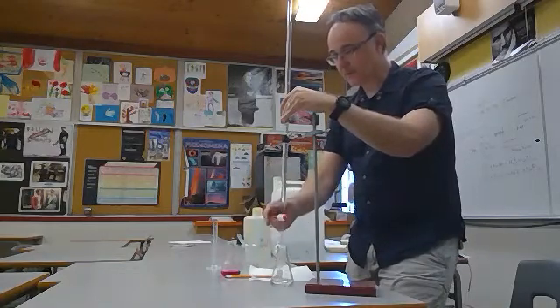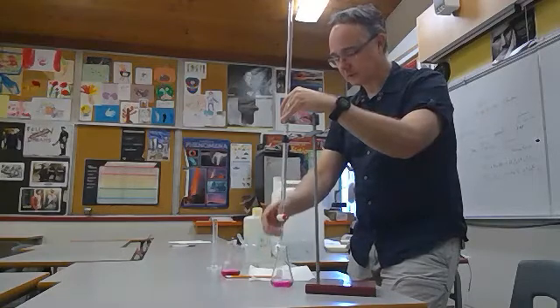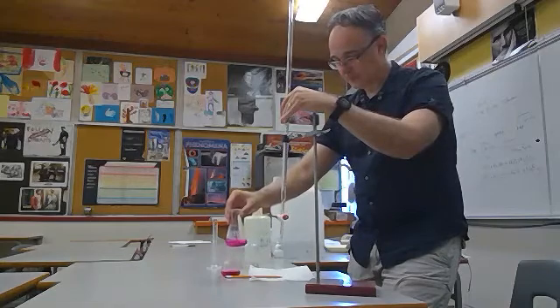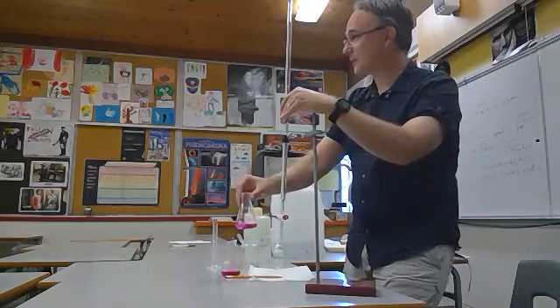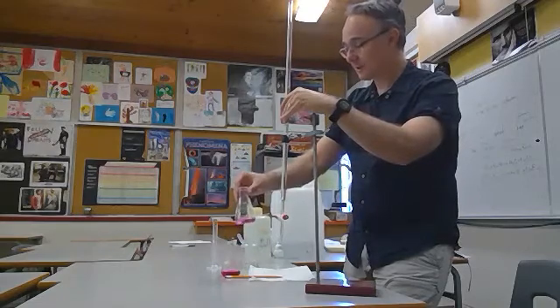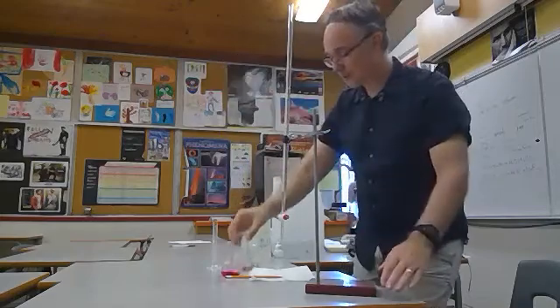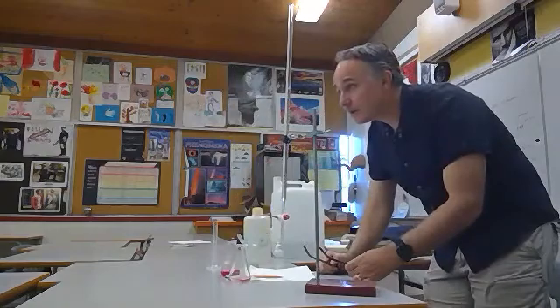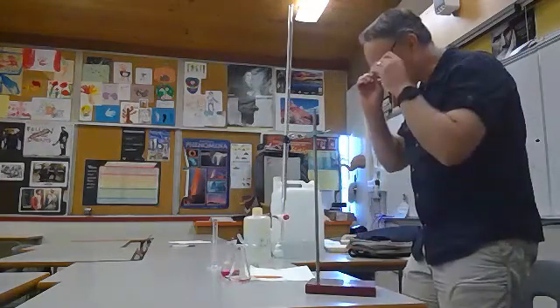A bit longer to get rid of the color change. So even that's almost too dark. I was basically a bit generous there. But you can see it's pretty light, quite a light pink. And so this final measurement here is 19.1 milliliters. So let's record that down, 19.1 milliliters.